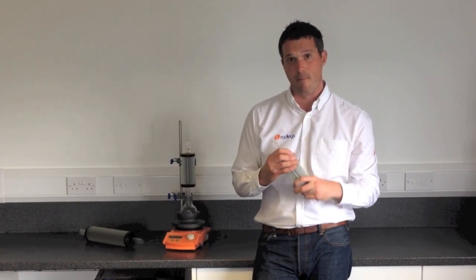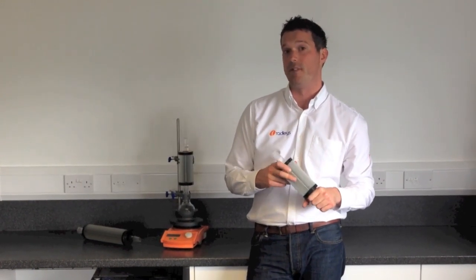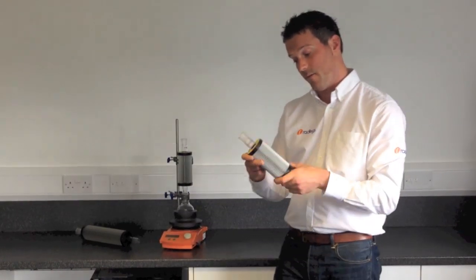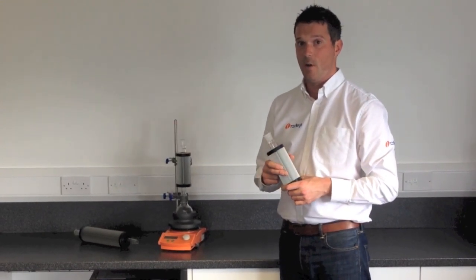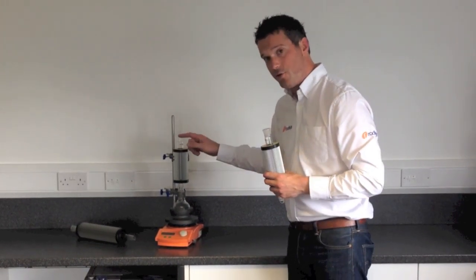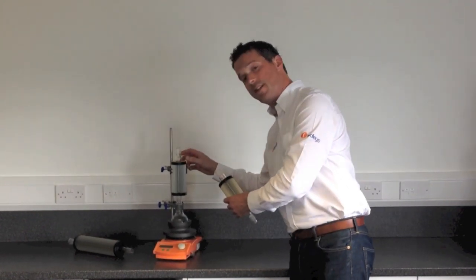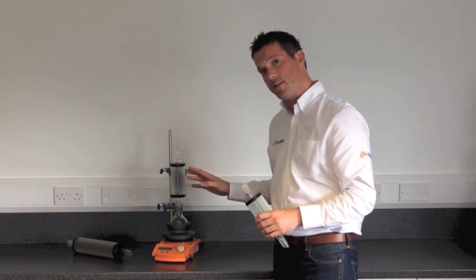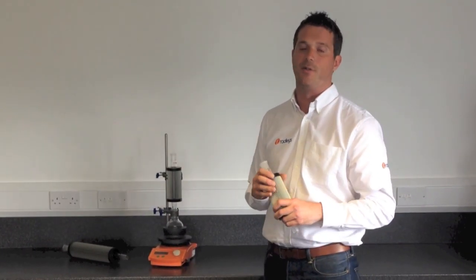Performance wise they're much more efficient than a standard air condenser. They're comparable to a water condenser in over 95% of all applications, but they don't use any water, which addresses environmental concerns about excessive water usage and will save money on water supply and water disposal. Because there are no tubes going to and from the condenser, they're nice and easy to set up. It also stops the risk of any floods because there's no pipework, so they're particularly good for overnight reactions or for condensers that are running constantly.